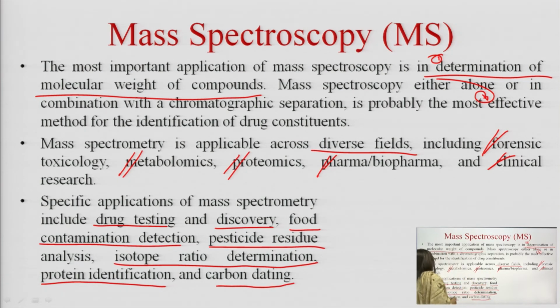See, isotope ratio determination is also of immense importance in phytochemistry, as here we are working on natural molecules which should be bioactive in nature, and as already suggested, not all isotopes are biologically active, only one or two isotopes, sometimes other isotopes.